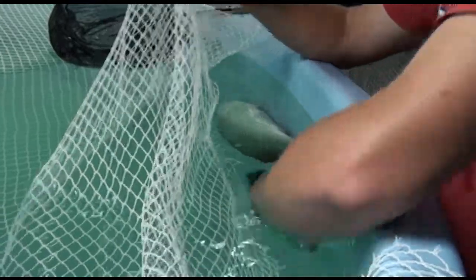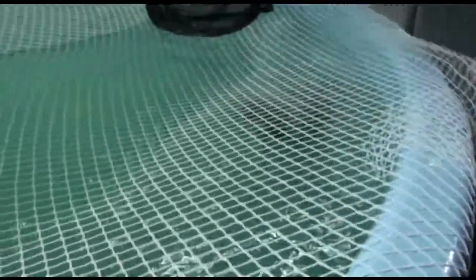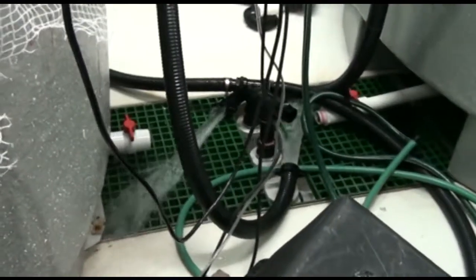The spawning tank should be covered with netting to prevent the fish from jumping out. When all the fish in a spawning tank are fully recovered from sedation, drop the water level to about one quarter full.